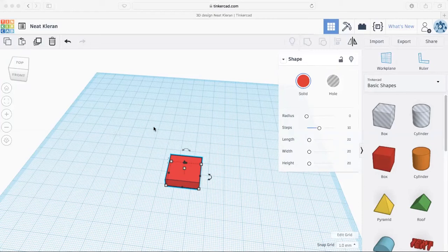And so here in the preview pane, you can see that I have my cube object. And if I go to the preview pane, you can see how the slicer program actually slices the model into layers.